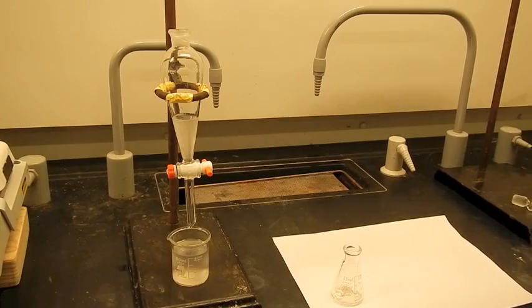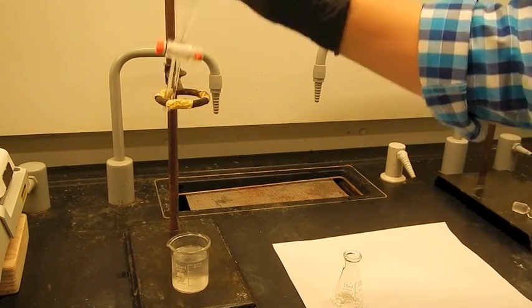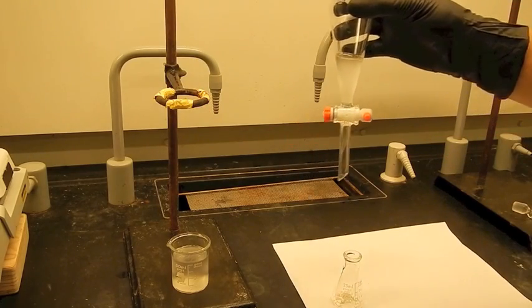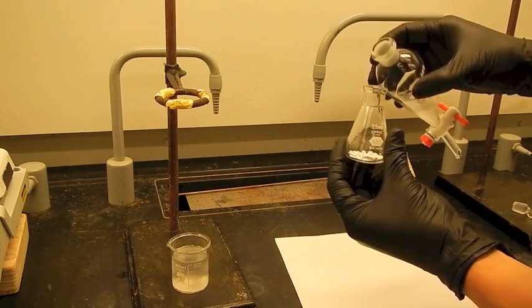All right. Now that I've drained off all of my aqueous washes, I can take my product and I'm going to just pour it into a flask that already has my calcium chloride drying agent in it.